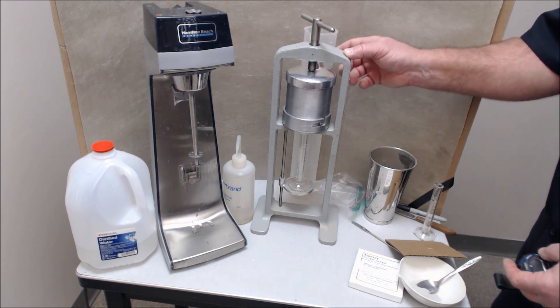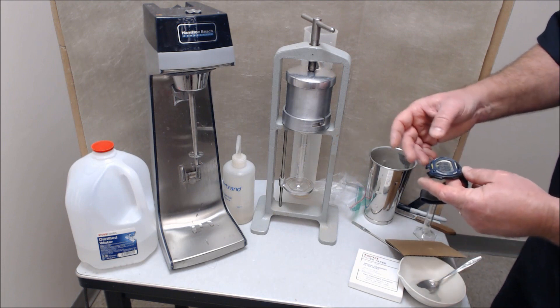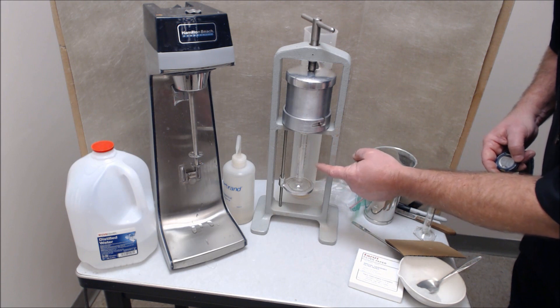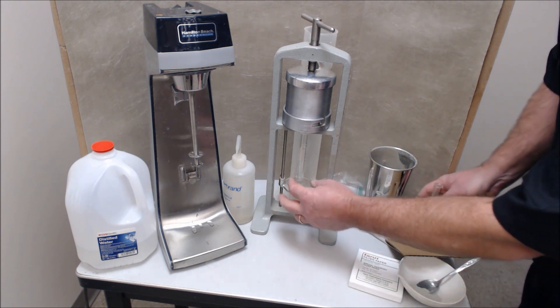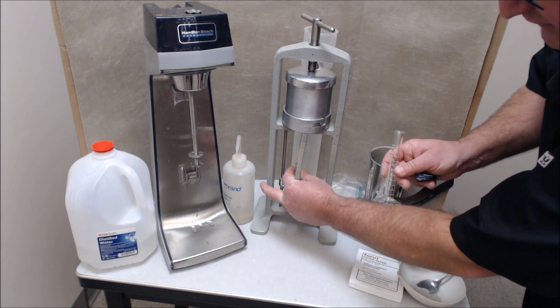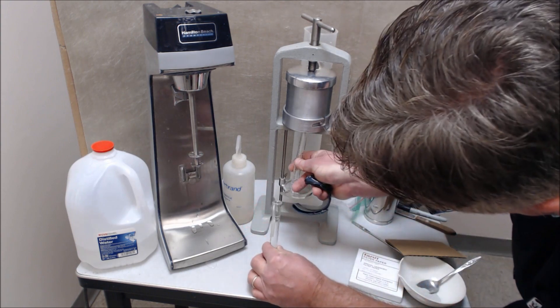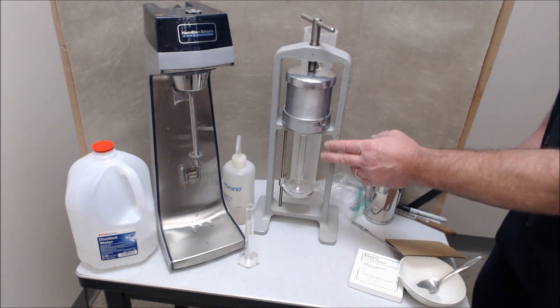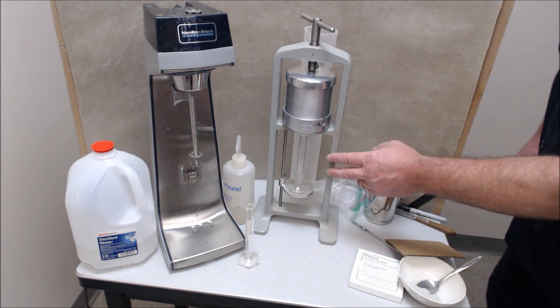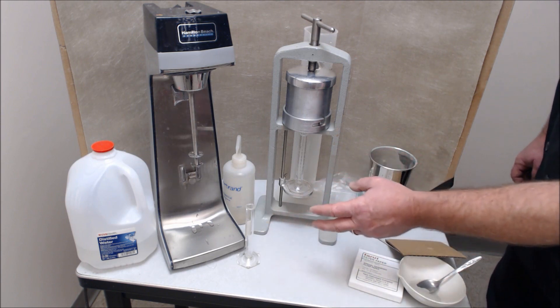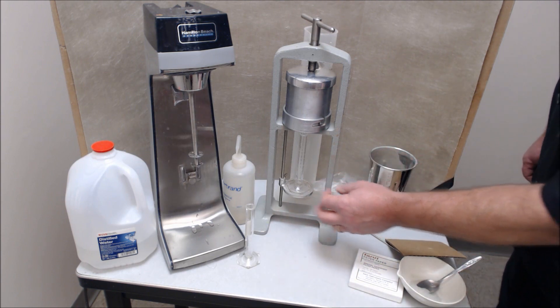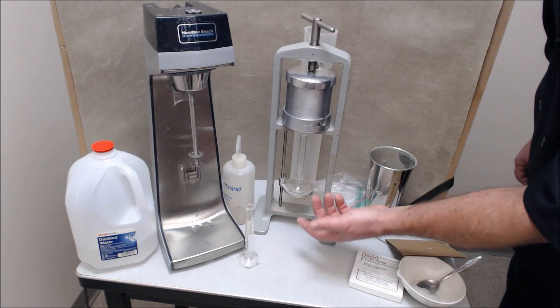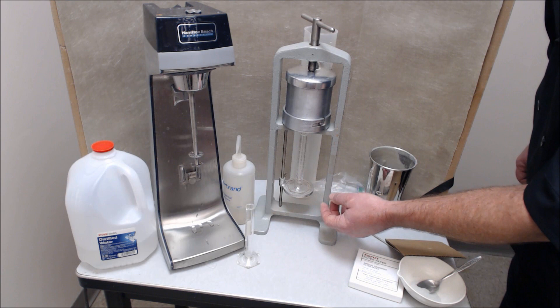That 100 psi is exerted at time equals zero. Then you will let 7.5 minutes pass and then switch out the two cylinders. You'll take the cylinder out and put the remaining one in. This remaining cylinder will be housed in here for 22.5 minutes. The total time is 30 minutes for running the test. This cylinder will accumulate fluid. It will look like clear water passing through it.